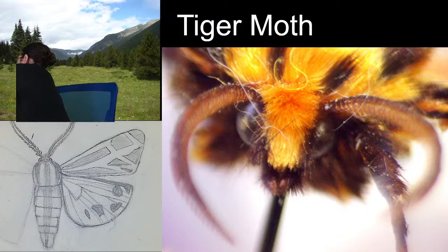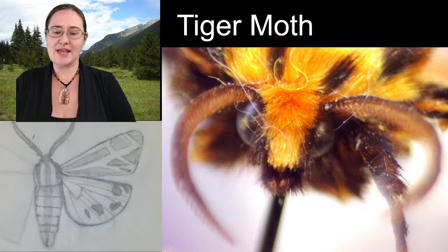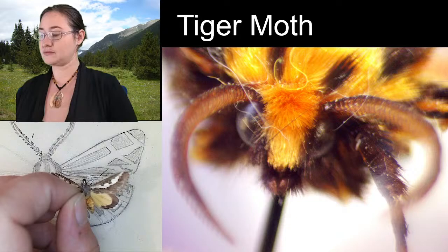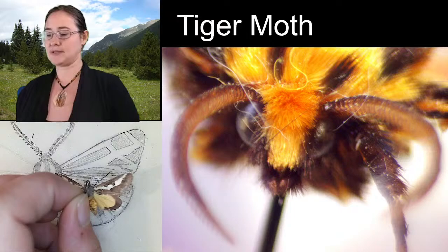Here's another tiger moth. I believe it's a species of cactus tiger moth. Give me a moment to look it up really quick. This one was collected in Arizona, and it's fairly common. I believe it's the Choya tiger moth. But I'm going to get confirmation really quick.